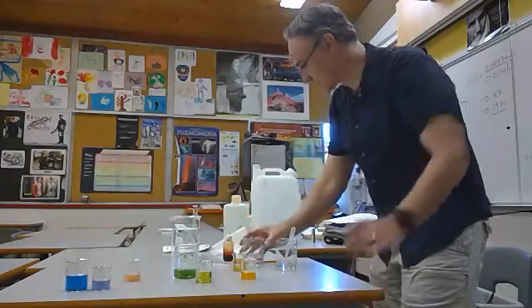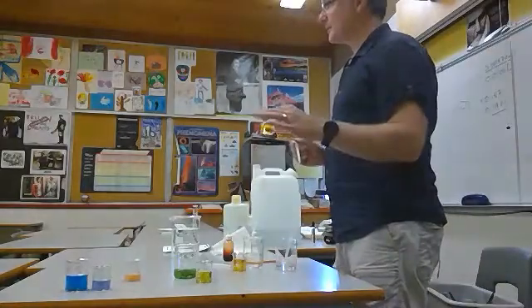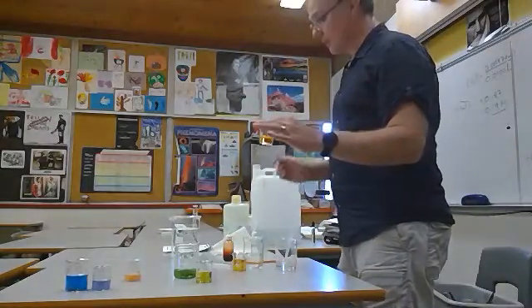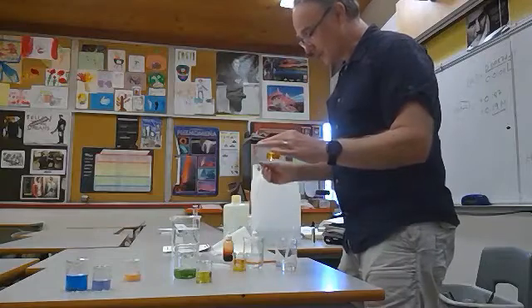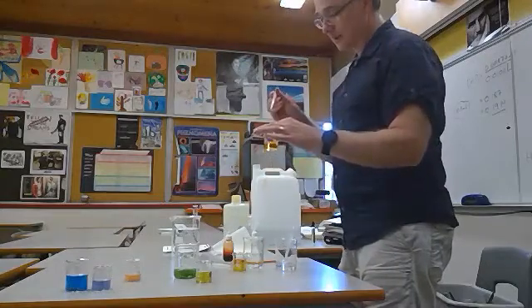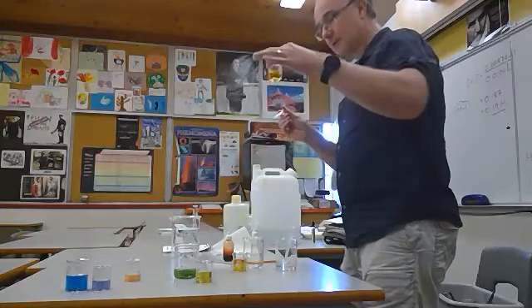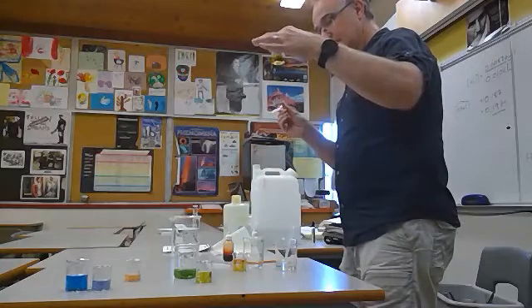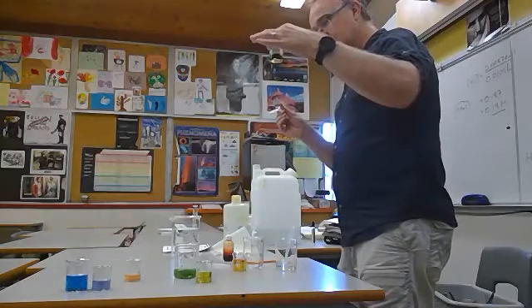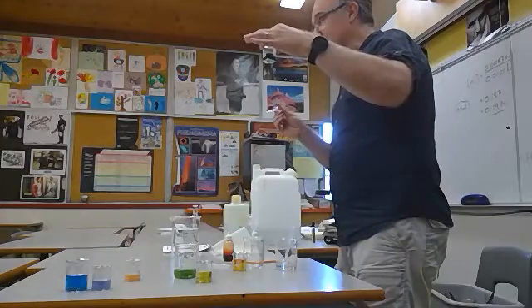And just to show you how dramatic this is. Remember, this was the one drop of acid in the water, turned it from green to orange or yellow kind of color. I'll just do the same thing with the base now. I'll just add a single drop. There's my drop. Now the acid is a bit more concentrated. Oh, maybe not in the bases. But that's well past green now, right?